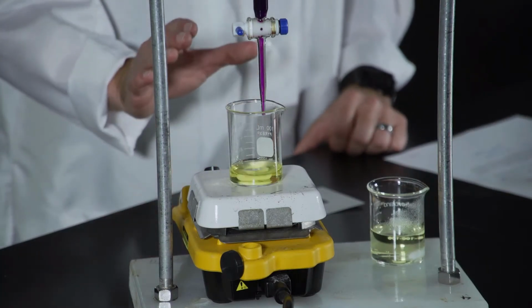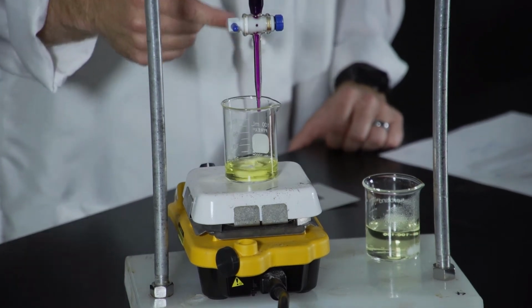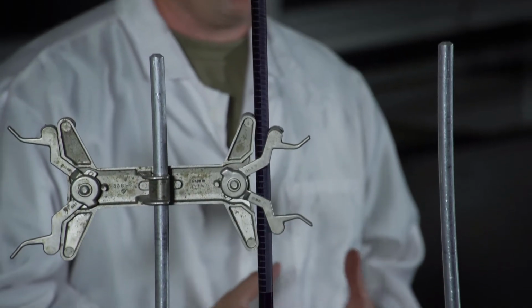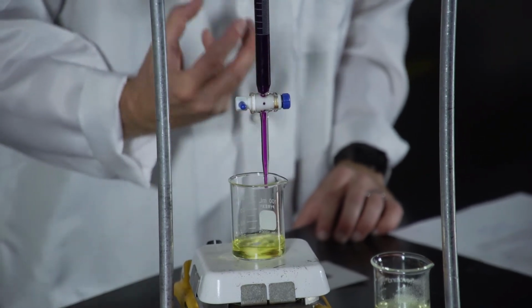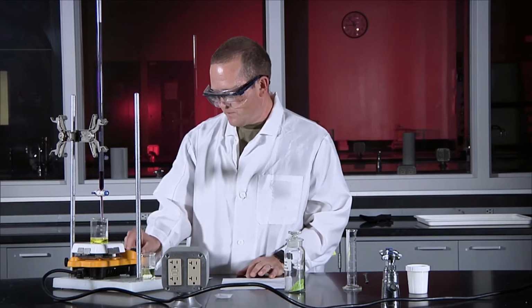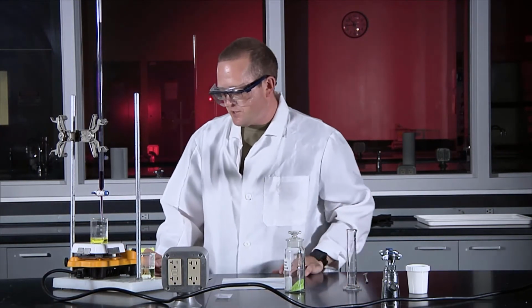But the reason that it needs to be hot is because when the permanganate drops in and mixes, that color change will be very slow if the solution is cold. So you need the solution to be hot in order to see that color change quickly so you can get an accurate endpoint. So we'll wait just a minute or so till we start to see condensation.